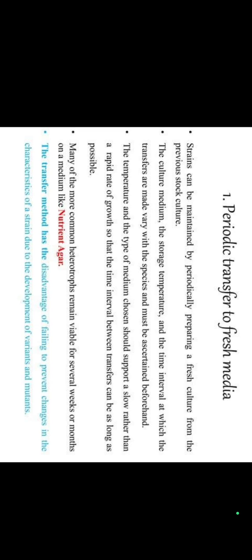First, periodic transfer to fresh media. Strains can be maintained by periodically preparing a fresh culture from the previous stock culture. The culture medium, the storage temperature, and the time interval at which the transfers are made vary with the species and must be ascertained beforehand.